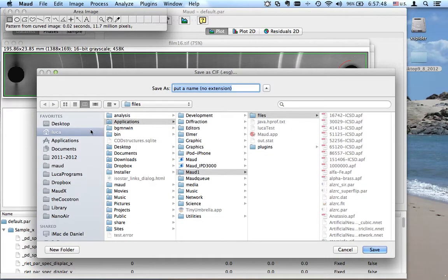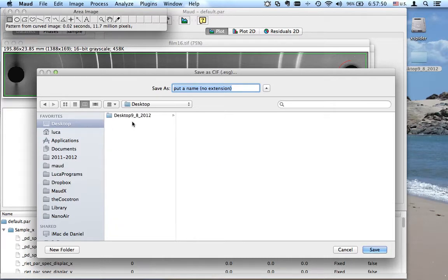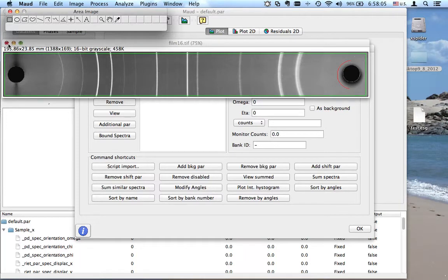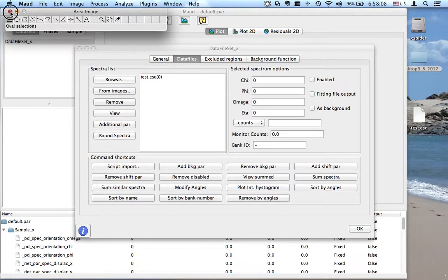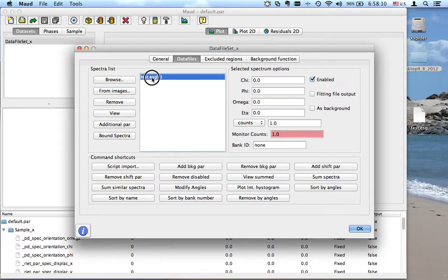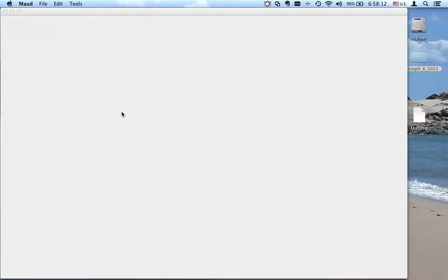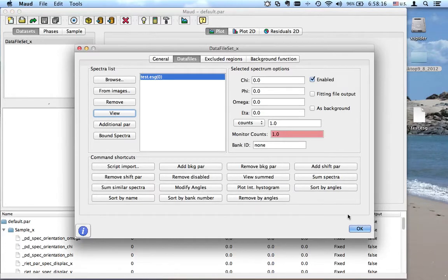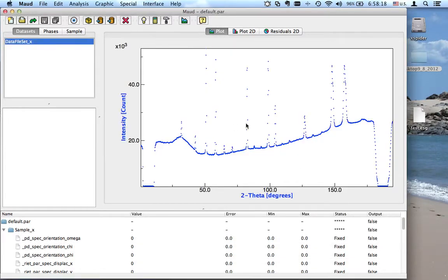I will save it to the desktop. Let's put the name: 'test.' You don't need to put an extension — it will be made by Mold. You see our file has appeared. Close, close, and the file was added here. I can check it — yes, this is it. We just close and we will get it here.